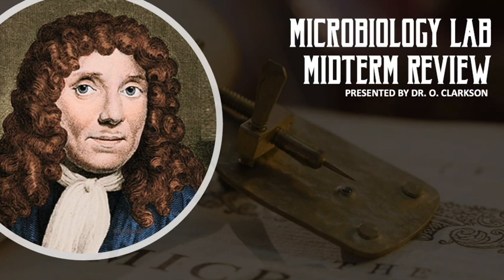So with positive staining, you're allowing the stain to enter into the negatively charged cell, and then what does that allow you to do? Allows the color to go in. Well, what does it allow you to do? When you look at the slide in microscopy, what do you see? Oh, color. You see the cell. You can see the shape of the cell, the size of it, and the aggregation patterns of the cells.